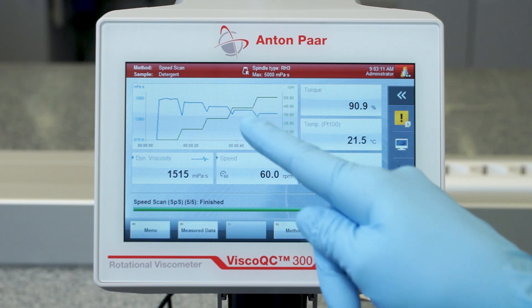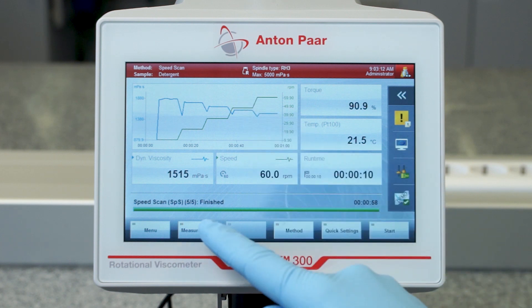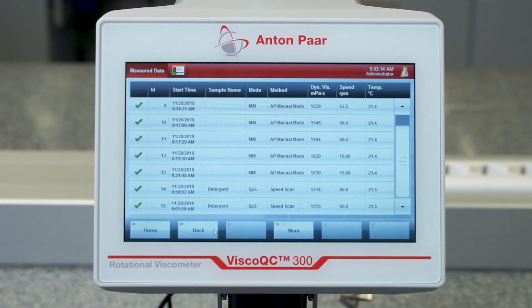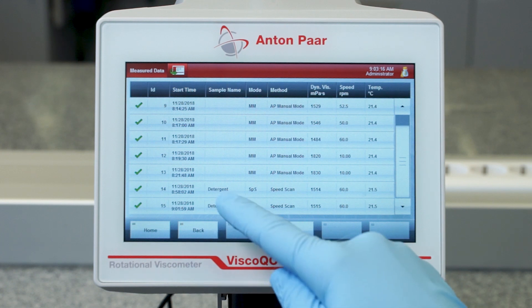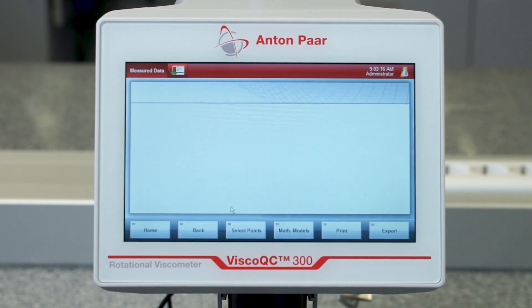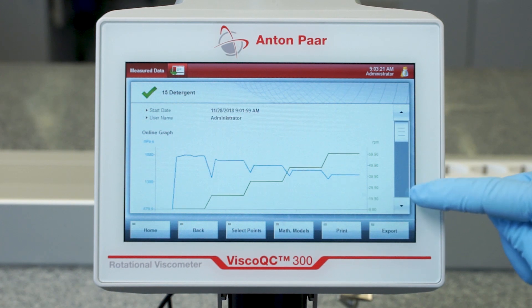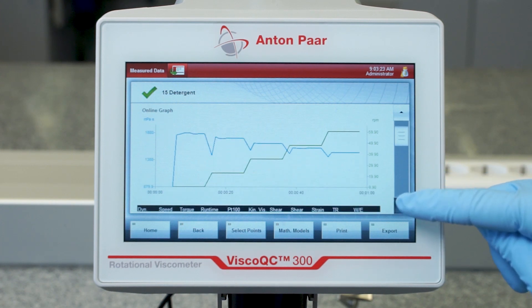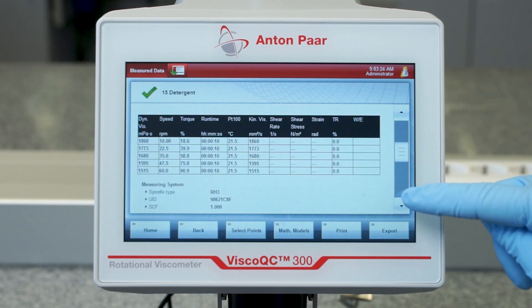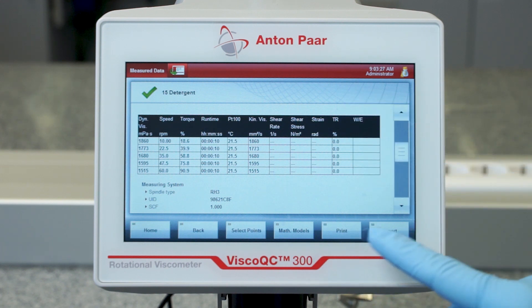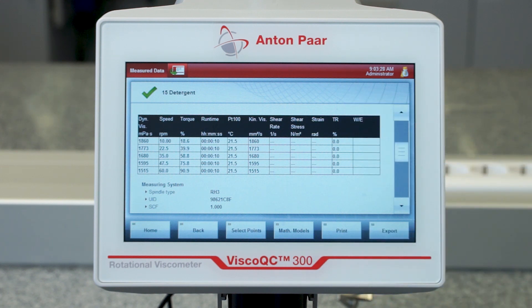As soon as your measurement is finished, your measured data as well as the online graph can be found in the data memory. You can simply print or export it.